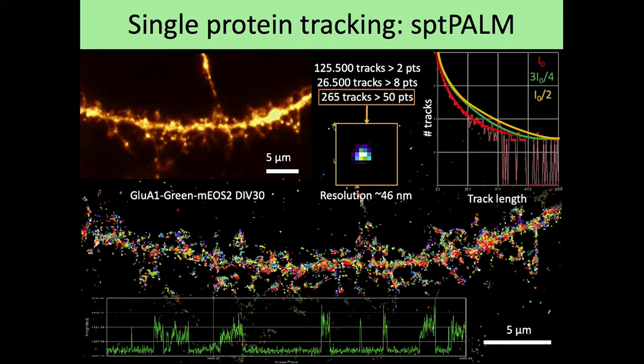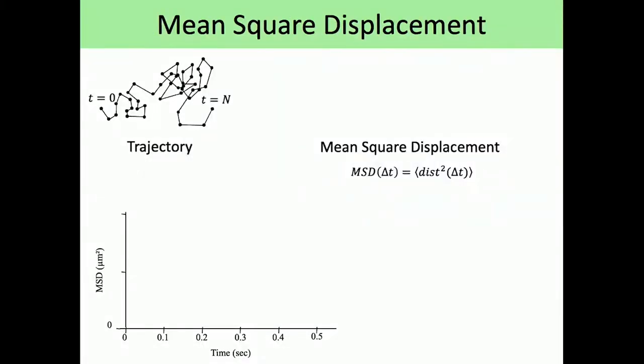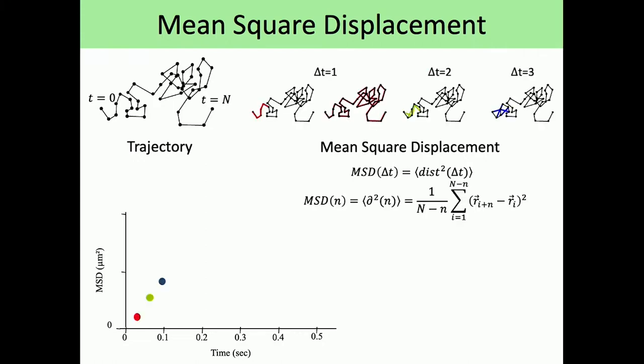So the longer, the more complex behavior you can get. After that, the most classical way to analyze is by mean squared displacement, which gives you information about the diffusive behavior. It exists for a long time, and then you get this instant mobility in the short term displacement. And when you explore further away in time, then you will get information about confinement, possibly.